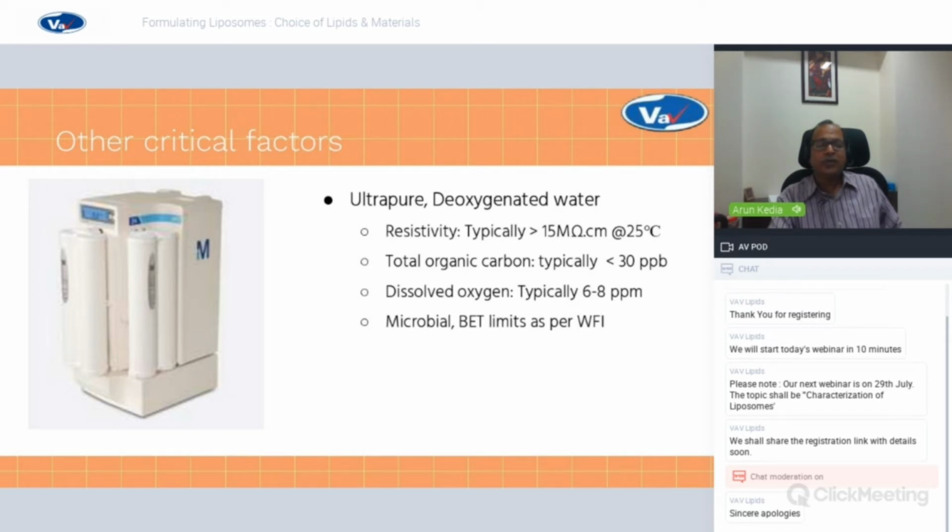We have seen a lot of failures of projects, typically because not enough attention was paid to the water. And so you must always use ultra pure and deoxygenated water. These limits have to be almost strictly enforced.